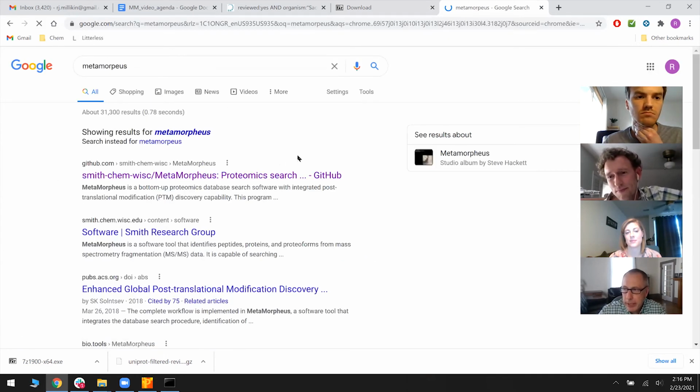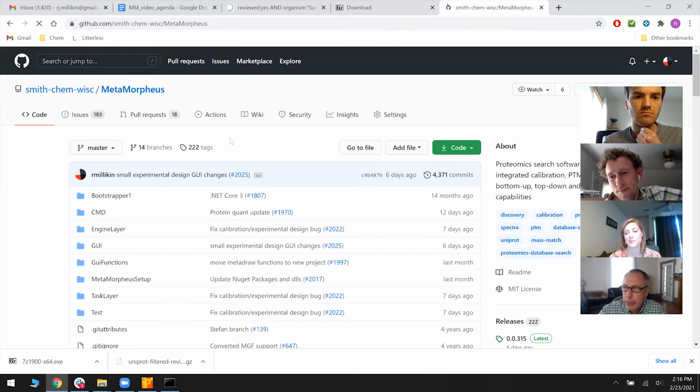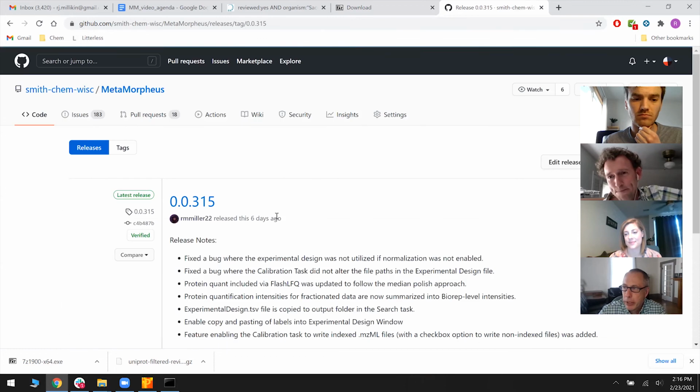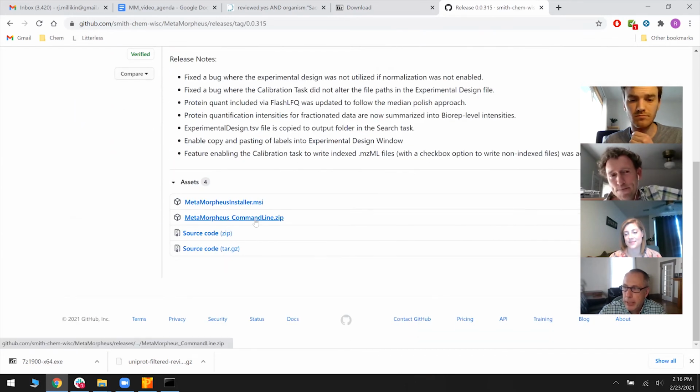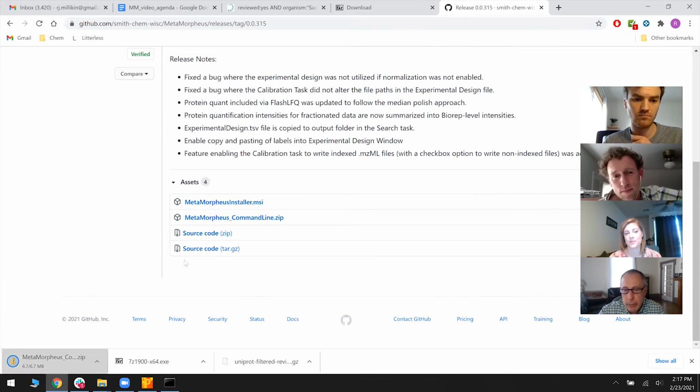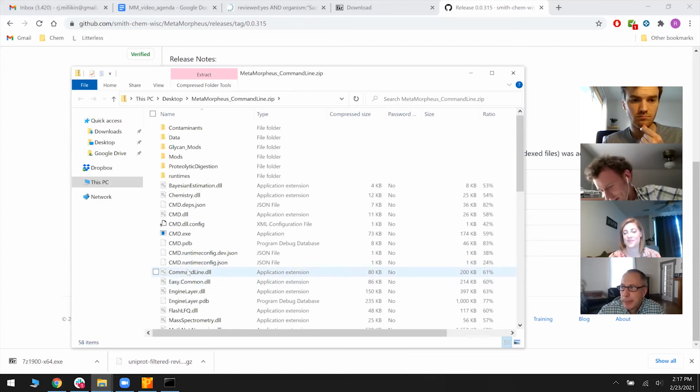Top-down is a perfect example. Our ability to do comprehensive top-down proteomics experiments is just not good enough as a field. We're just skimming the very top, most abundant proteins, very low molecular weight. We are not doing comprehensive top-down proteomics. There's a whole bunch of work to do. So we can go to meetings and haggle and argue about how to attack that problem. And there's good competition yet to be had. No, that's one of my favorite things.